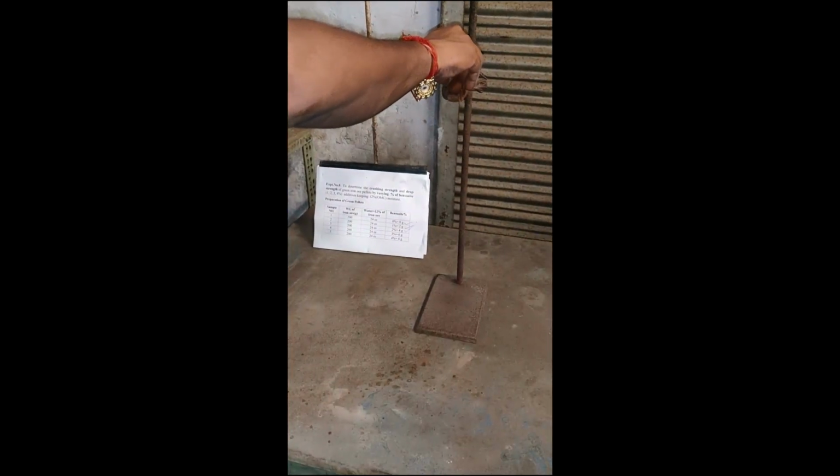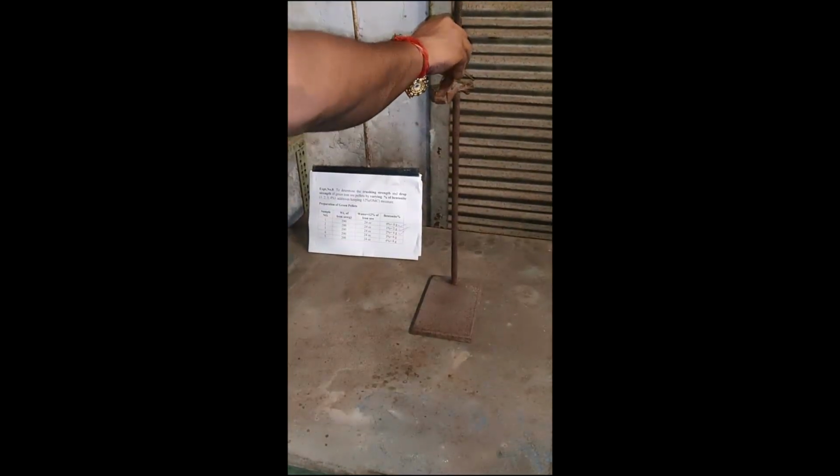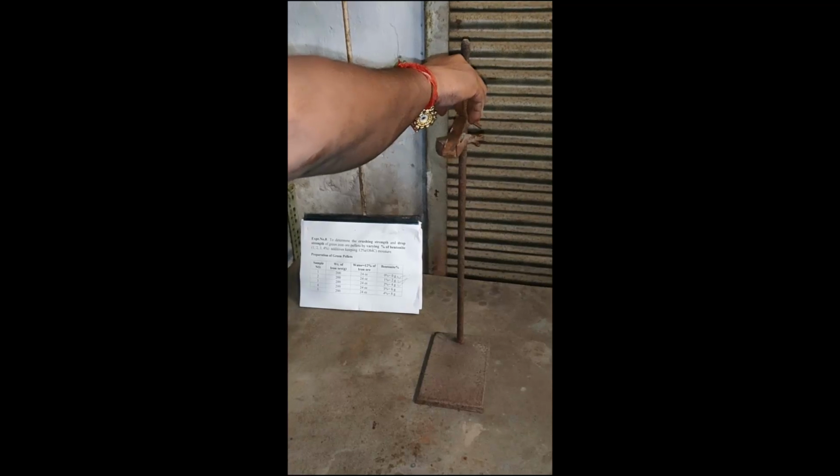Second drop. Third drop. Fourth drop. Fifth drop. Sixth drop. Seventh. Eighth drop.